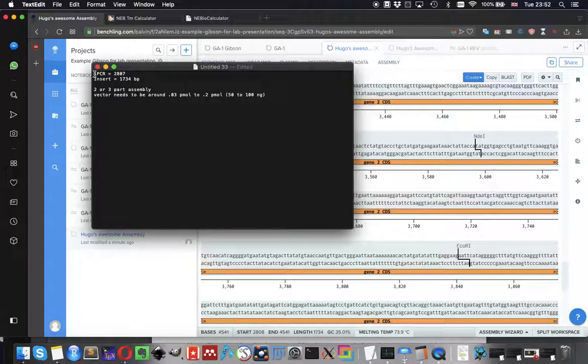So let's say you did your gel purification and you get 30 microliters of IPCR product at around 35 nanograms per microliter. And then the other one, I always dilute in 30 microliters of insert at around 40 nanograms per microliter. And these are just generic stats that you can get. You might get different data.